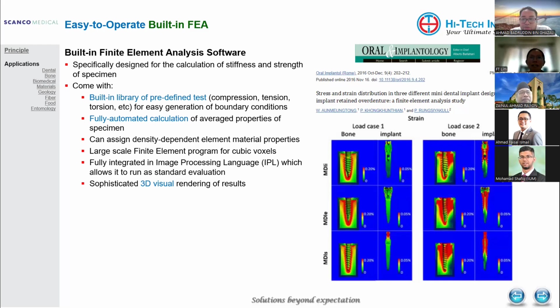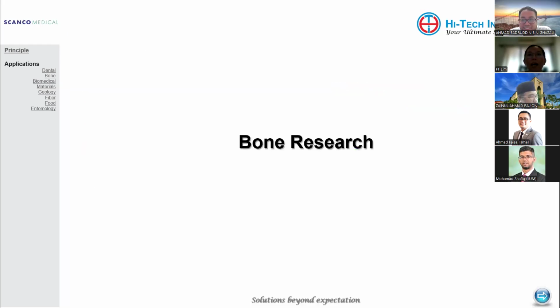Okay, we have one more question from Dr. Ain. I think she's the radiation protection officer from our hospital. She's asking, in terms of safety, does it require specific shielding like the common medical CT that we have in our faculty or in our hospital?